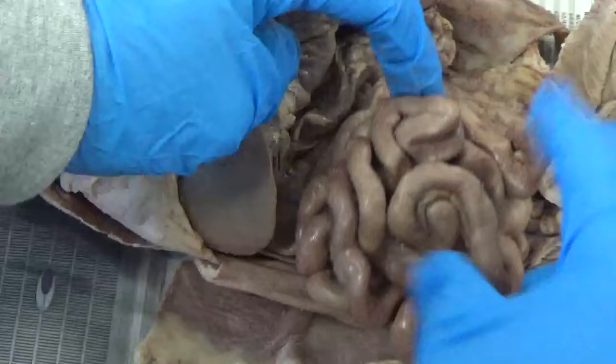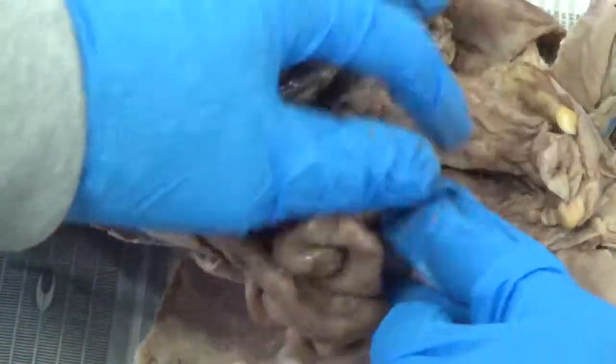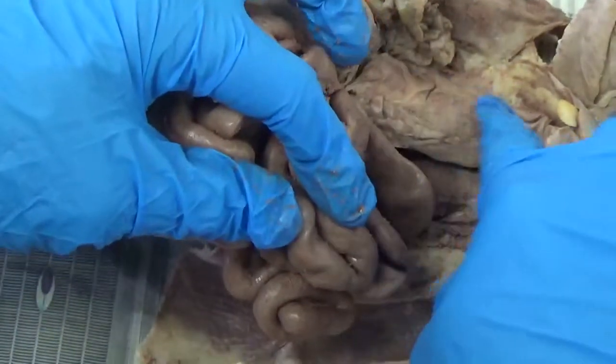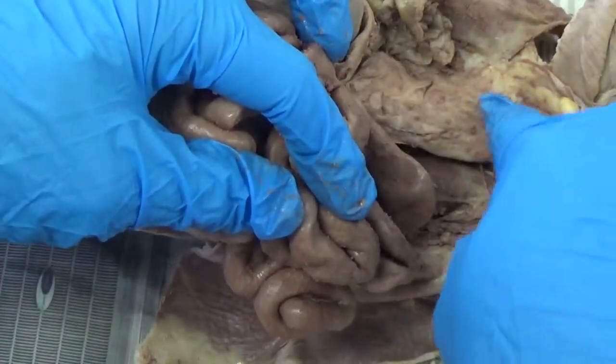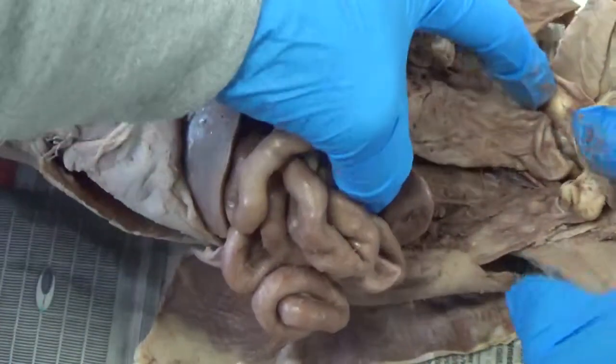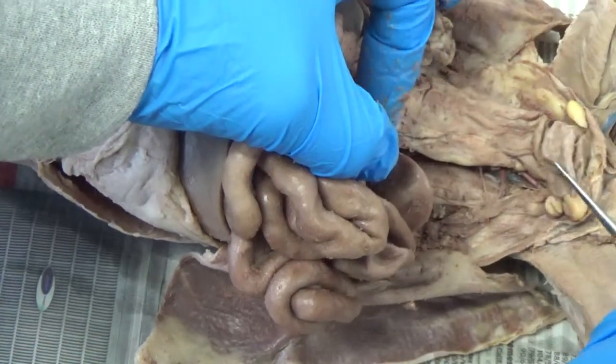Normally what we do later on is we would take these out and we would measure the length of the small intestine. The large intestine is right here, part of it. This is the descending colon right here. And then down here, if you lift up, you can see the urinary bladder right here.